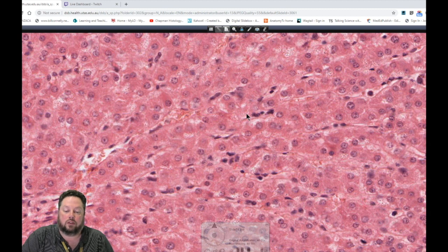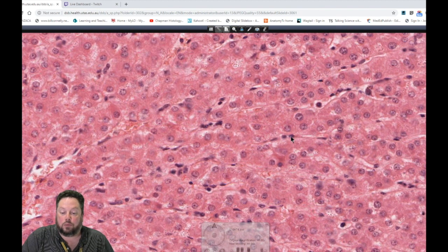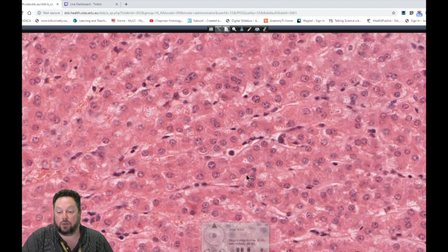So whenever you get fibrosis of the liver, it's thought that the hepatic stellate cells actually undergo hypertrophy and potentially hyperplasia, and therefore increase in number and cause a deposition of increased connective tissue. So anything sort of rounded, we would say, is either a hepatocyte, a Kupffer cell, or a hepatic stellate cell, or a cell of Ito.